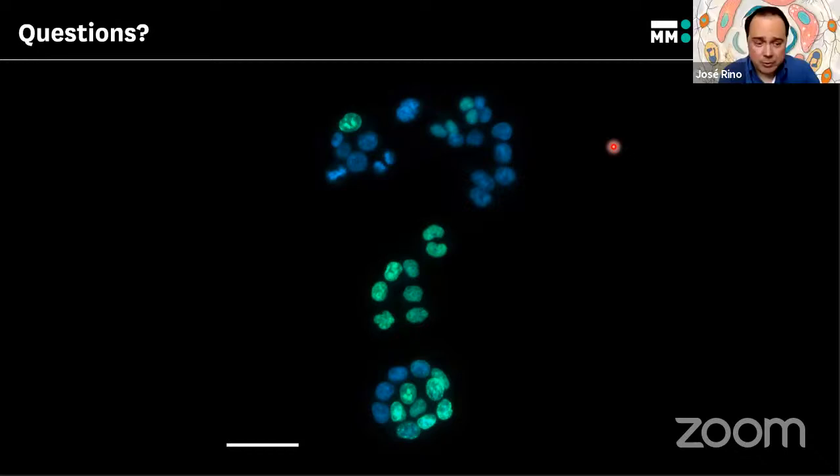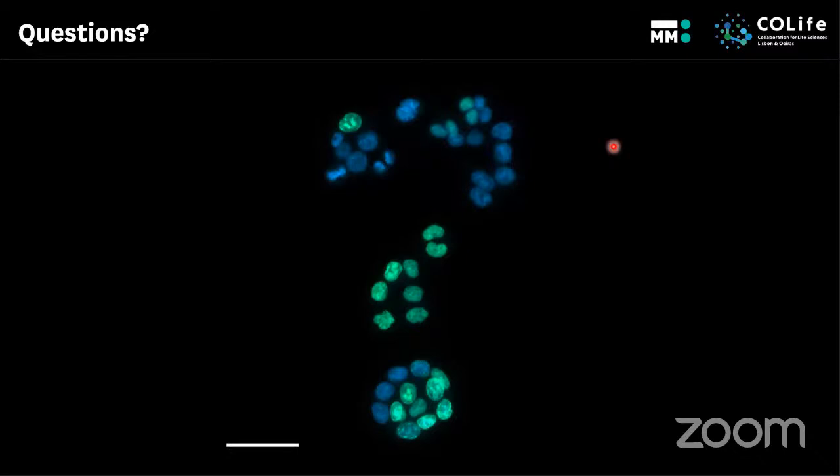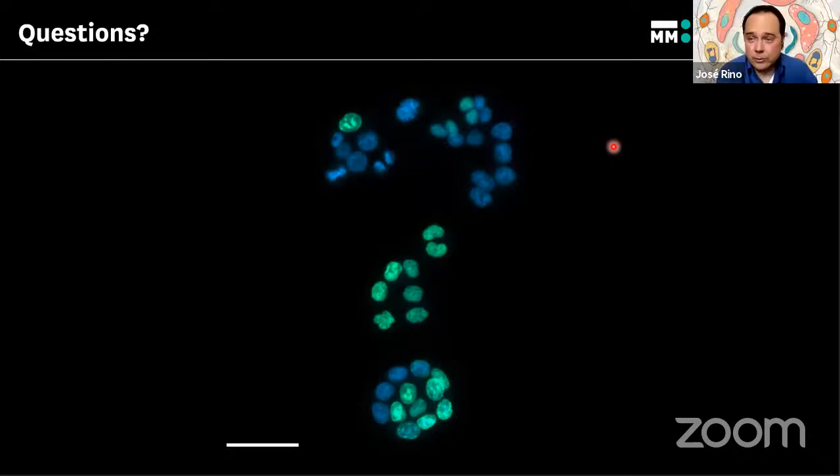Well, there are a couple of reasons. One is the camera, as you're mentioning. The camera on the spinning disk is typically, and in our case, 512 by 512 pixels. For the same field of view on a confocal microscope, where you acquire an image point by point to match the optical resolution, you would have to acquire with an optimal pixel size, an optimal frame size of 1 megapixel, even more, maybe 1800 pixels, something like this.